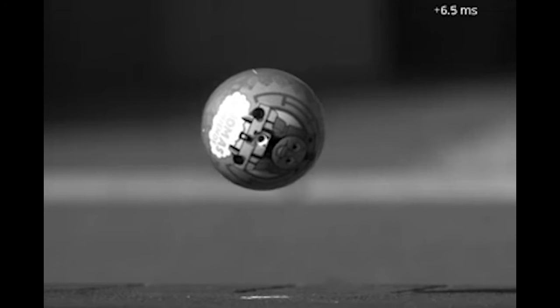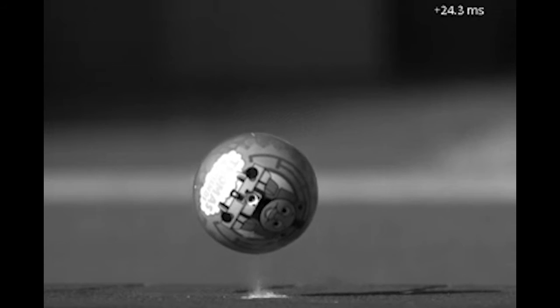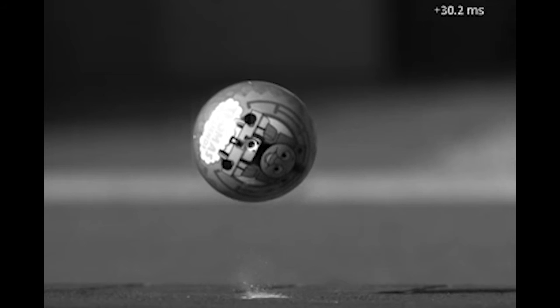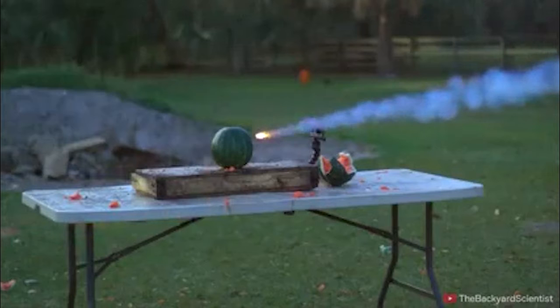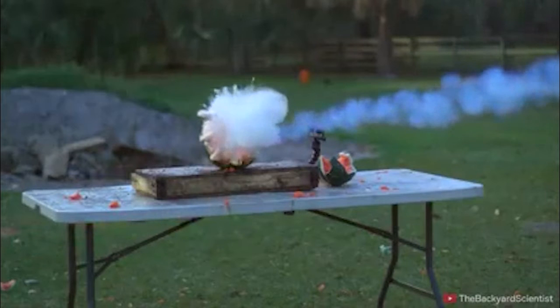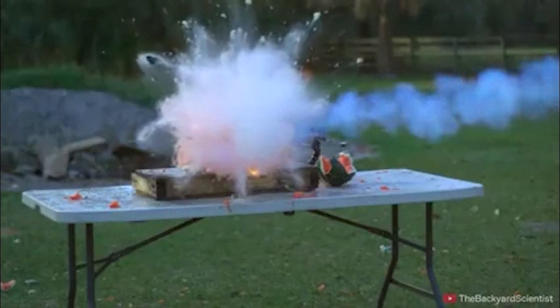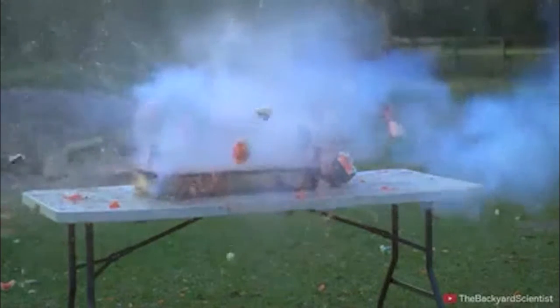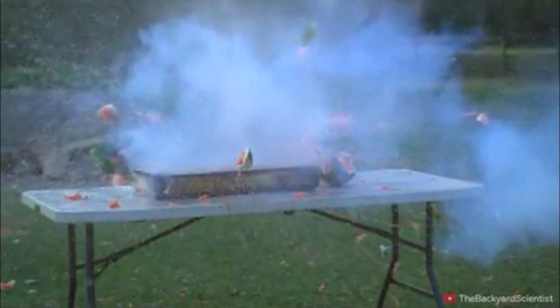What I want to discuss today is what exactly happens when this electron beam hits the surface of your sample. If your brain works like mine does, you're probably thinking that this interaction looks a bit like a ball bouncing on the ground, where the electron hits the surface and bounces back into the detector. But in actuality, it is probably better represented by a bullet being shot at a watermelon that explodes into a million pieces. This is because the particles in the electron beam are moving with such intense speed and energy that they are capable of breaking apart the individual atoms that make up matter and sending them scattering.